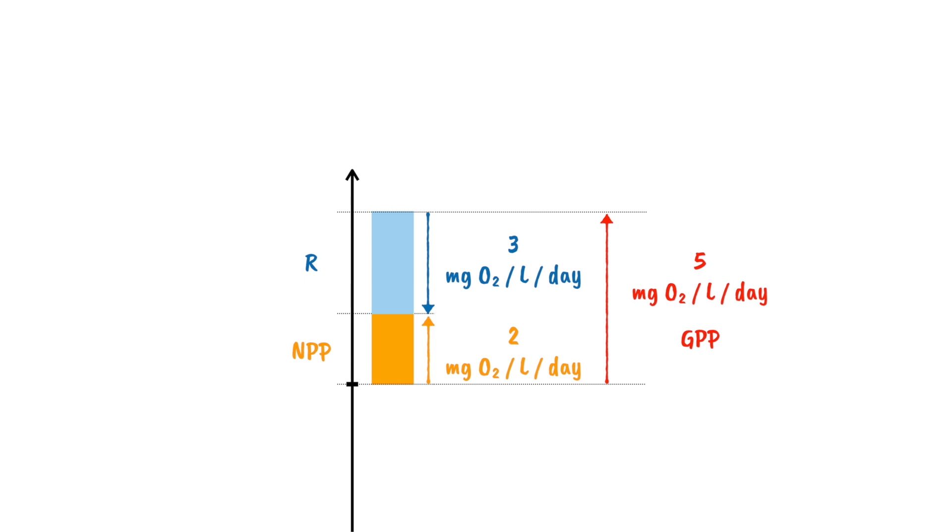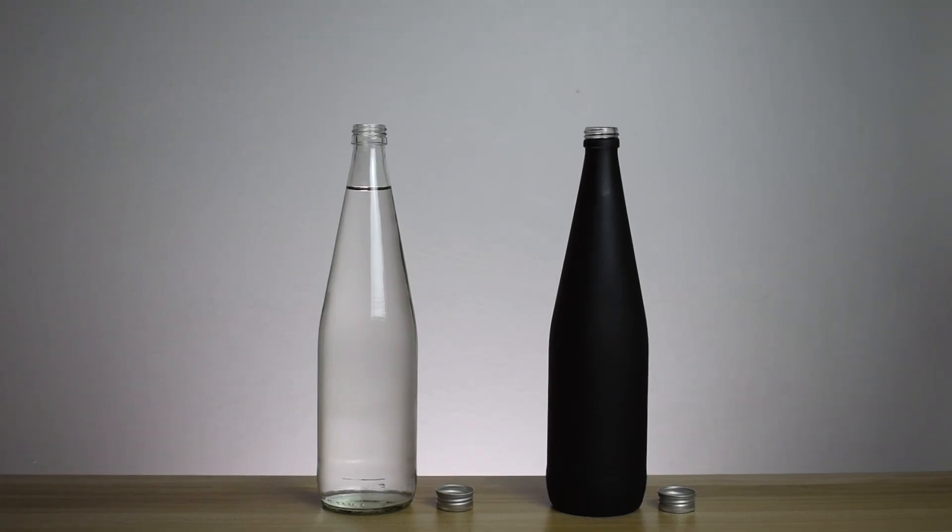Let me walk you through doing this for real and pull the ideas together. Take two samples of water from your sample site. One bottle should be transparent. The other should be covered. Mine here has been spray-painted black, but covering it with something opaque will also work.